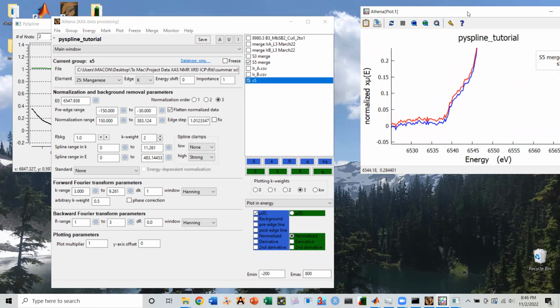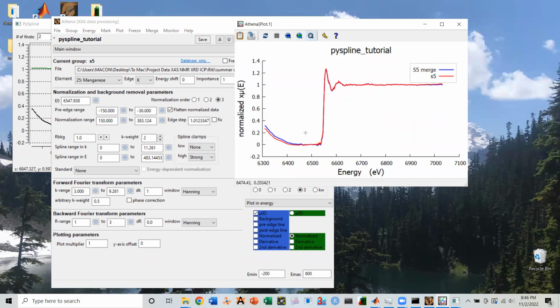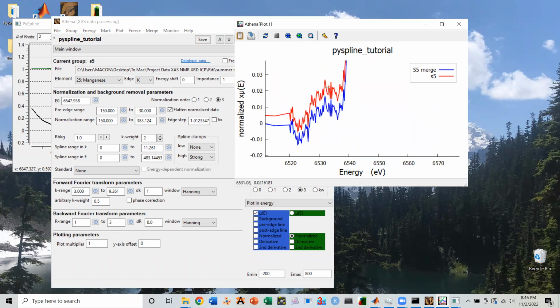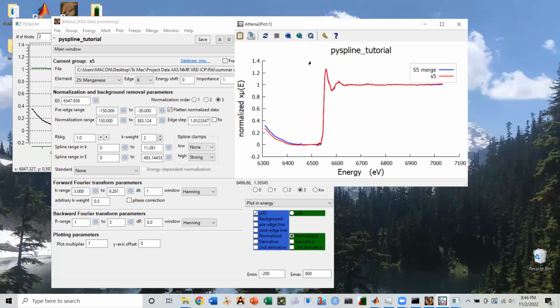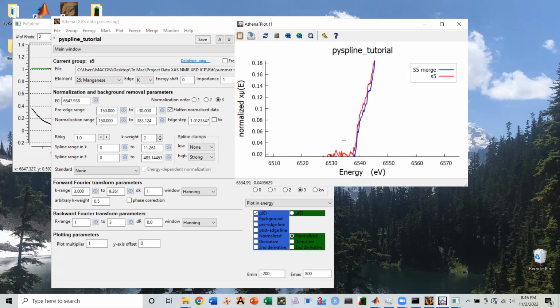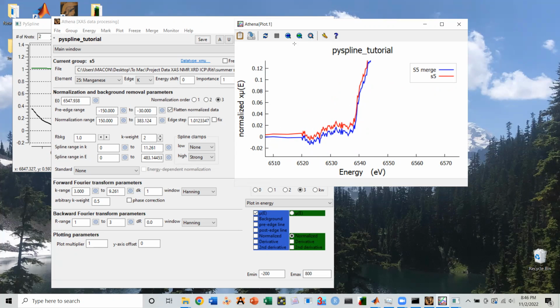You know, my spline is a little above that, so you can kind of see with this really noisy pre-edge feature here, this might give you a slightly better chance of fitting that, maybe not. I think with data like this, you'd have to probably play around with both and see. Yeah, it's kind of funky, isn't it, how this dips here. This is very noisy data. This data I don't think would be suitable for pre-edge analysis.